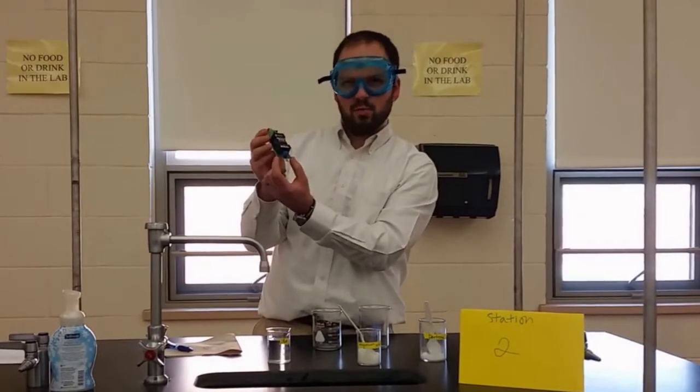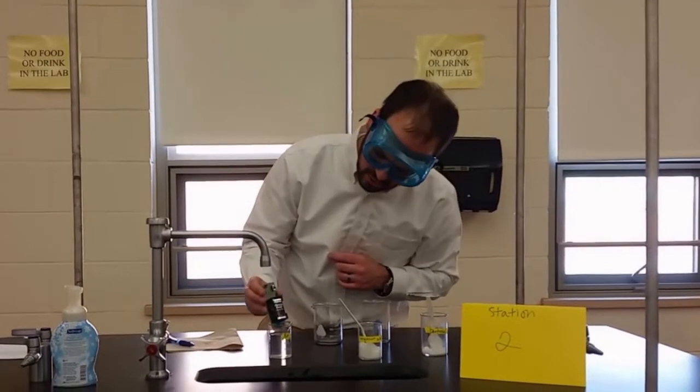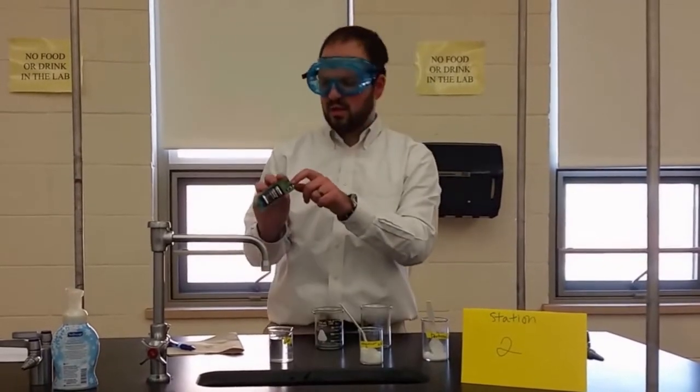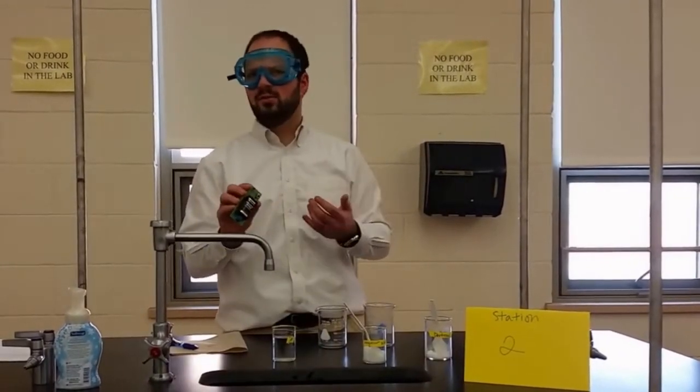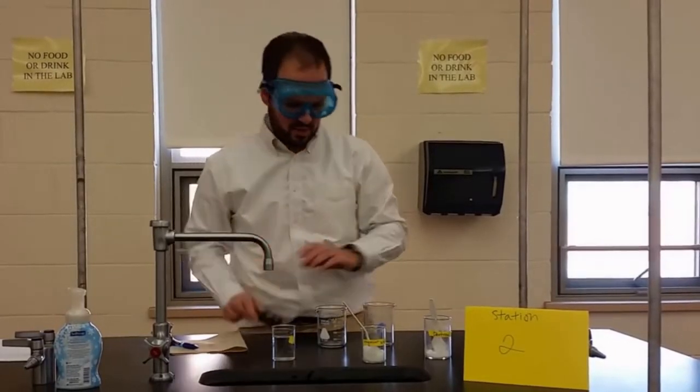So we're going to lower the 2 metal probes into the distilled water. Do not get the circuit board wet. You don't want to lower the whole circuit board into the water, just the 2 tips. And we're going to check to see if it lights up at all. Does it light up? Does nothing light up? And we're going to write down how conductive it is.